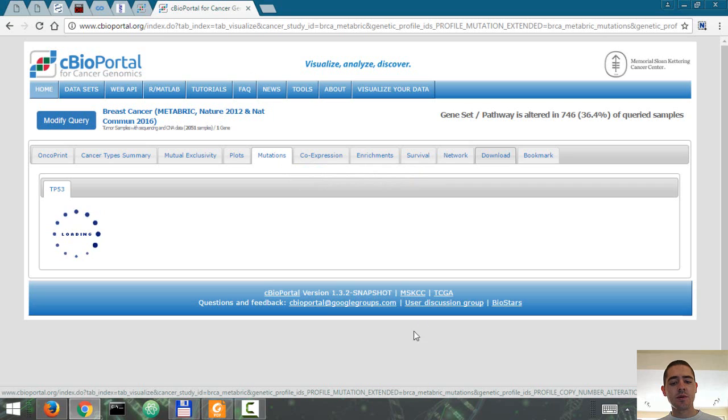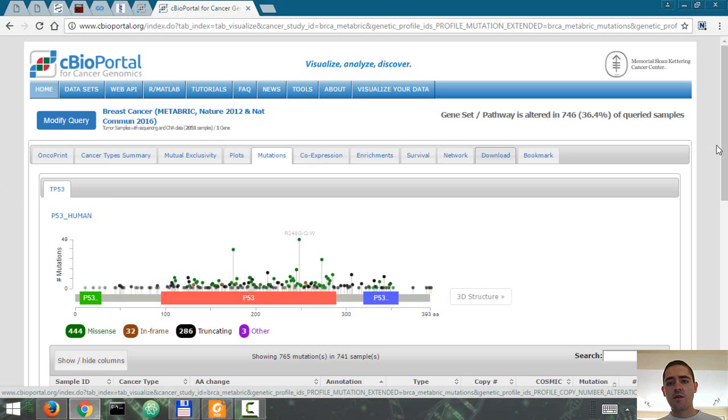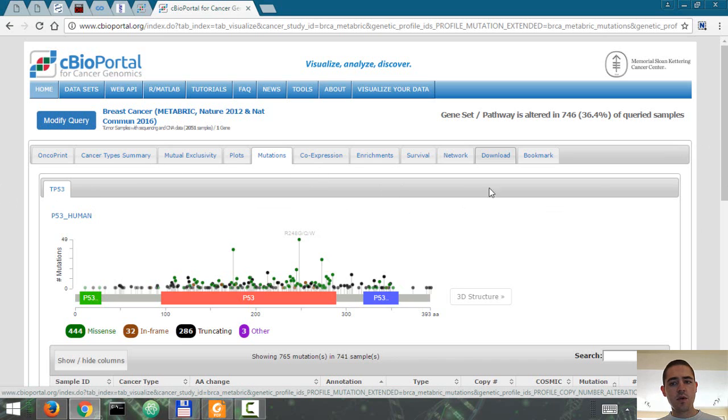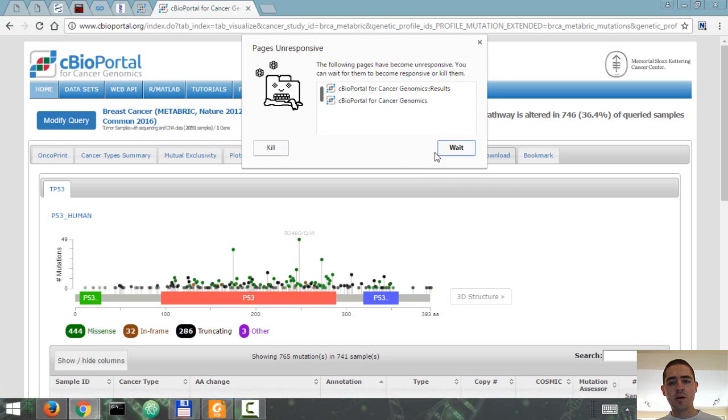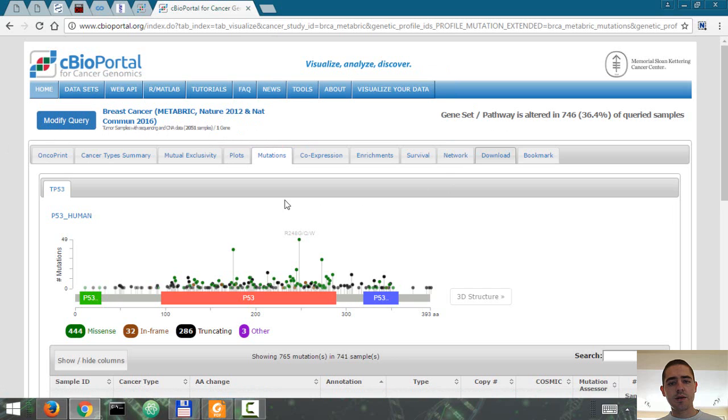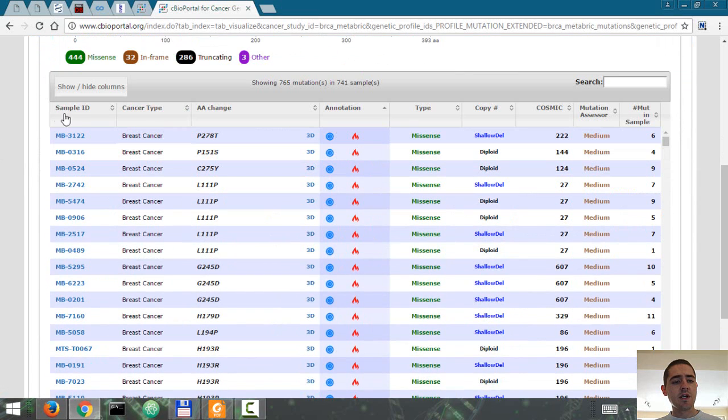It's going to take a while to load. And apparently it froze, hopefully not for long. So there are a lot of things that you can do on cBioPortal. Let's just wait. You can also see the survival rates in each individual sample.